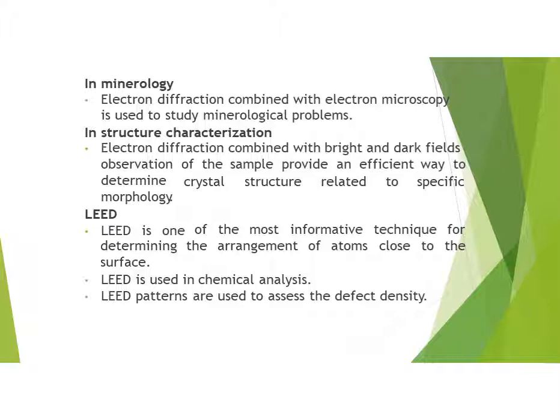The low energy electron diffraction technique is one of the most informative techniques for determining the arrangement of atoms close to the surface. In chemical analysis, low energy electron diffraction patterns are used to assess the defect density.